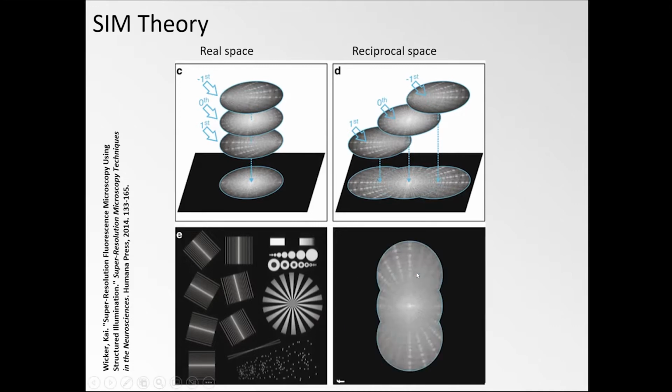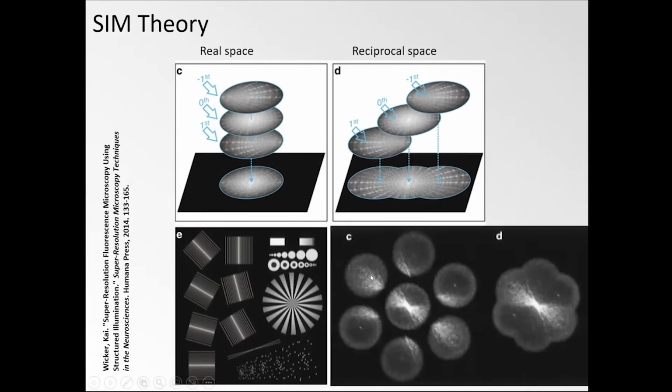And actually it turns out if you use 3 pattern orientations rotated by plus or minus 60 degrees, then you can essentially extend almost uniformly the coverage out twofold. So this here is what you normally get through a microscope. And these are these additional information bands encoded by structured illumination and then stitched together to a passband that is about twice as large.